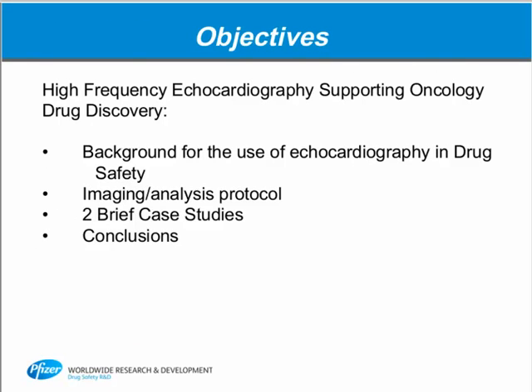Today, what I'd like to cover in the next 10 minutes or so focuses on oncology because that's what I work on a lot, but as mentioned previously, this spans multiple therapeutic areas. I'll give a little background on how we got into using echo, what our basic image and analysis protocol entails. I'll do 2 very brief case studies and then just tie it all up at the end.